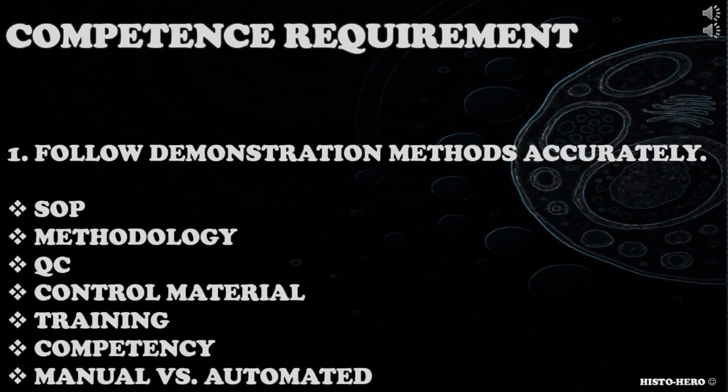Candidates should be able to accurately follow demonstration methods. Can the candidate perform H&E staining in your lab? Do they use manual or automated method? Do they know if the demonstration method worked correctly? Do they follow local methodologies and SOPs during staining?